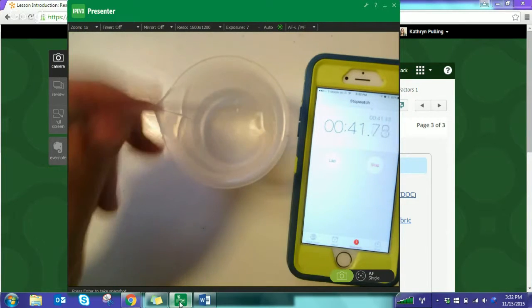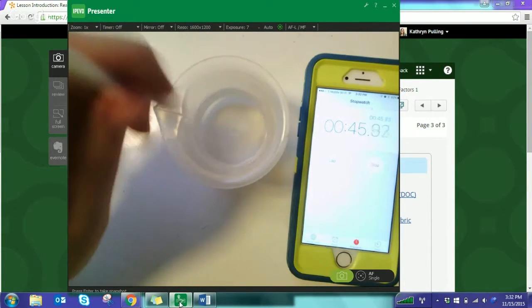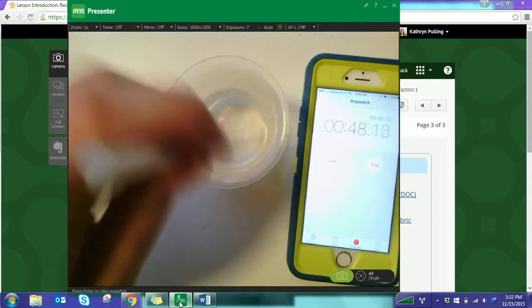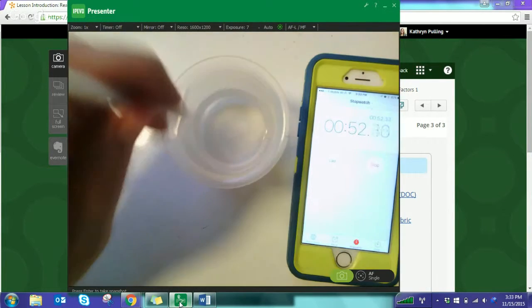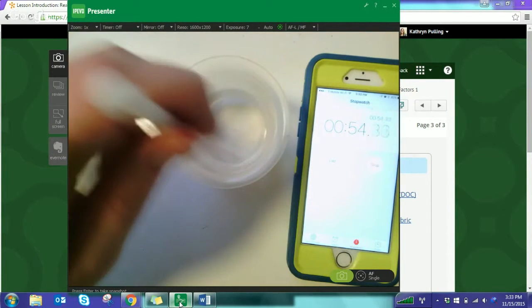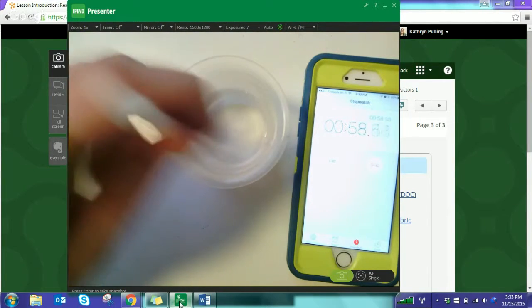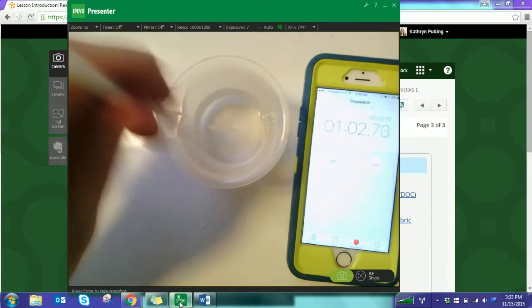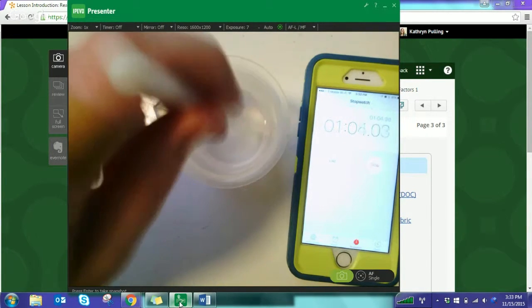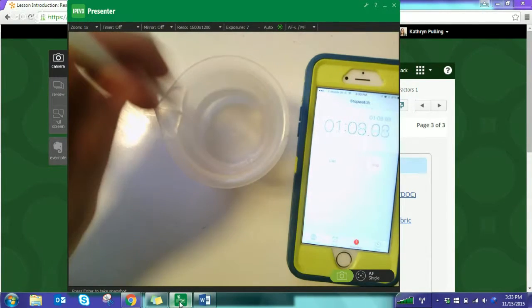Try not to stir differently in any round, right? Again, a control. We just want the concentrations to be what's affecting how quickly stuff happens. So if you stir really vigorously in one, you're increasing the collisions versus another one. And then maybe it's your stirring that's causing the difference. So try to stir at the same rate in each one as best you can, so that the only thing we're really changing are the concentrations of our chemicals.